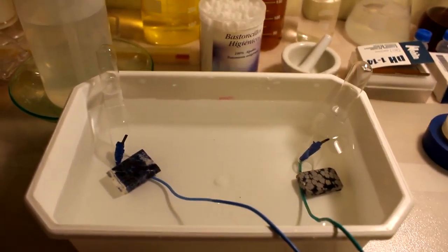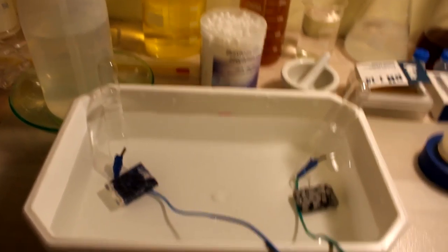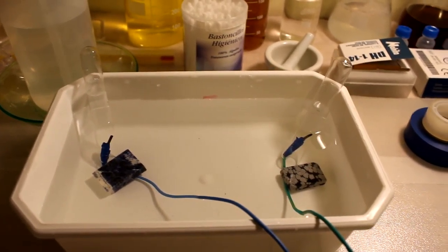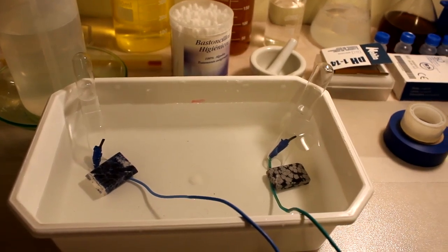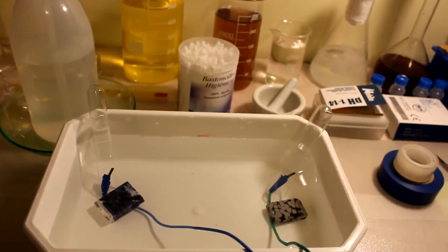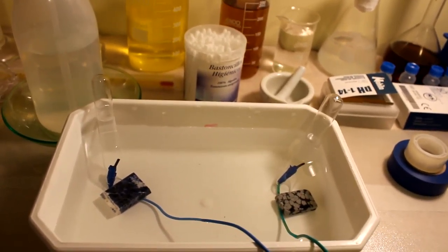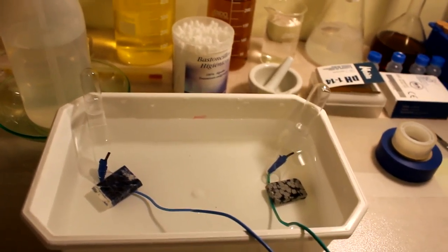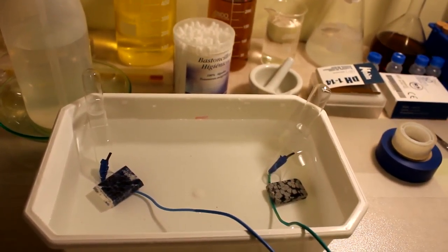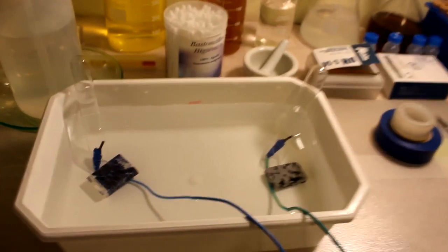A ver, otra cosa importantísima que se me ha olvidado, que si no, no funciona. Como veis, le he marcado ahí el nivel de agua en el que está ahora. Hay que echarle un poquito de vinagre, porque si no, nada, no hay tutía. Vinagre, que es ácido acético al 5%, cuya fórmula es CH3COOH. Vamos a echarle un poquito.